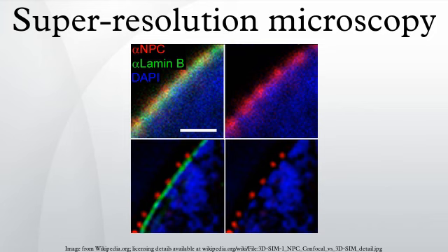Highly specific labeling of biological structures with photoswitchable probes has been achieved with antibody staining, direct conjugation of proteins, and genetic encoding. STORM has also been extended to three-dimensional imaging using optical astigmatism, in which the elliptical shape of the point spread function encodes the X, Y, and Z positions for samples up to several micrometers thick, and has been demonstrated in living cells. To date, the spatial resolution achieved by this technique is 20 nanometers in the lateral dimensions and 50 nanometers in the axial dimension, and the temporal resolution is as fast as 0.1 to 0.33 s.